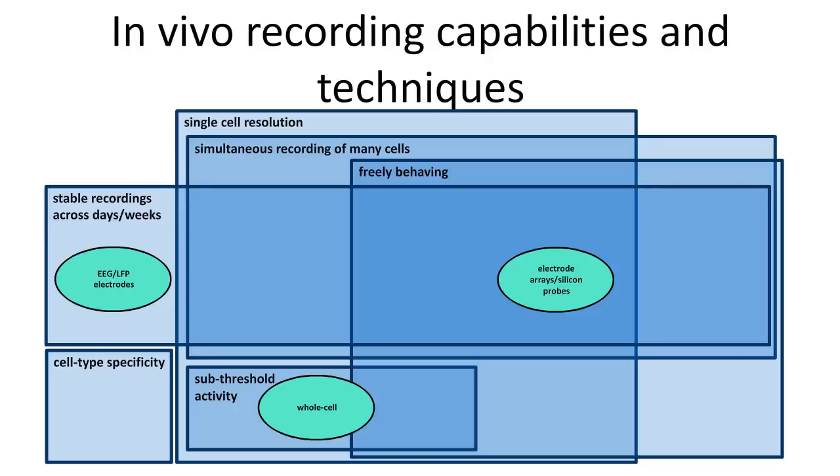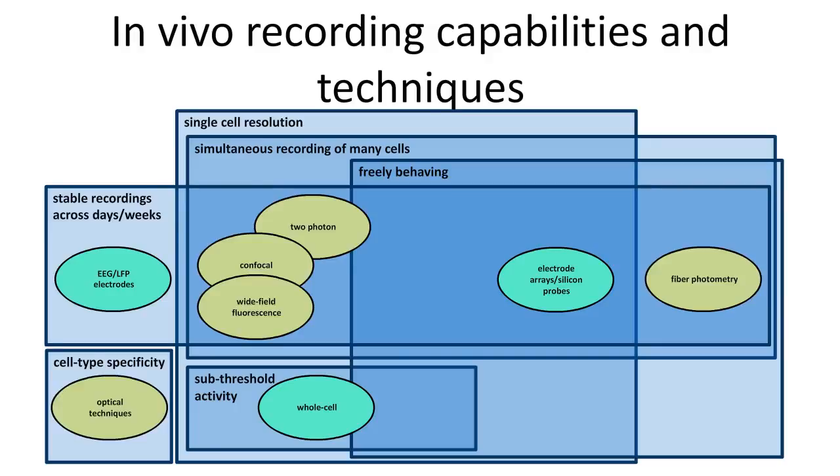And so one technique that has been developed recently by the Schnitzer lab and later commercialized is these miniaturized fluorescence microscopes. And we decided to try to build these microscopes ourselves and then to improve on them to make the new generation of these microscopes and then to make them available to the community.